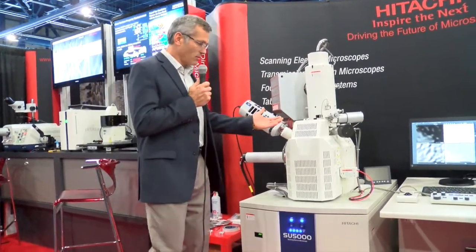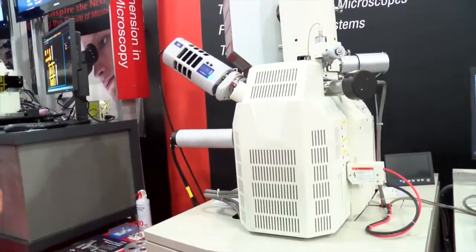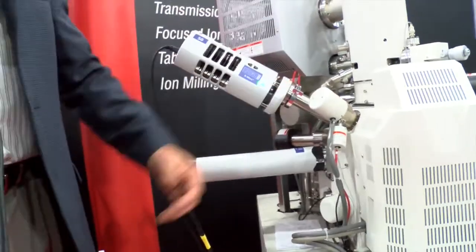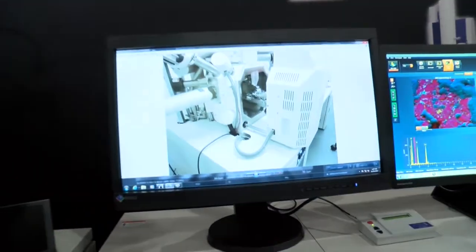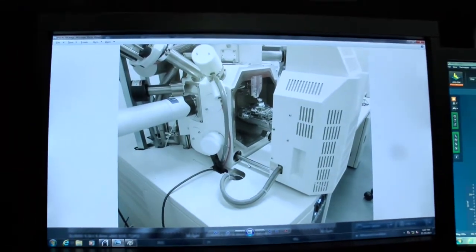As you can see here, it is a very large chamber. It can handle 200 millimeter diameter samples as well as an 80 millimeter tall sample. It also has a pullout chamber door, and as you can see here on the screen, it has a stage-mounted door. We feel at Hitachi that's the best way to handle your samples.